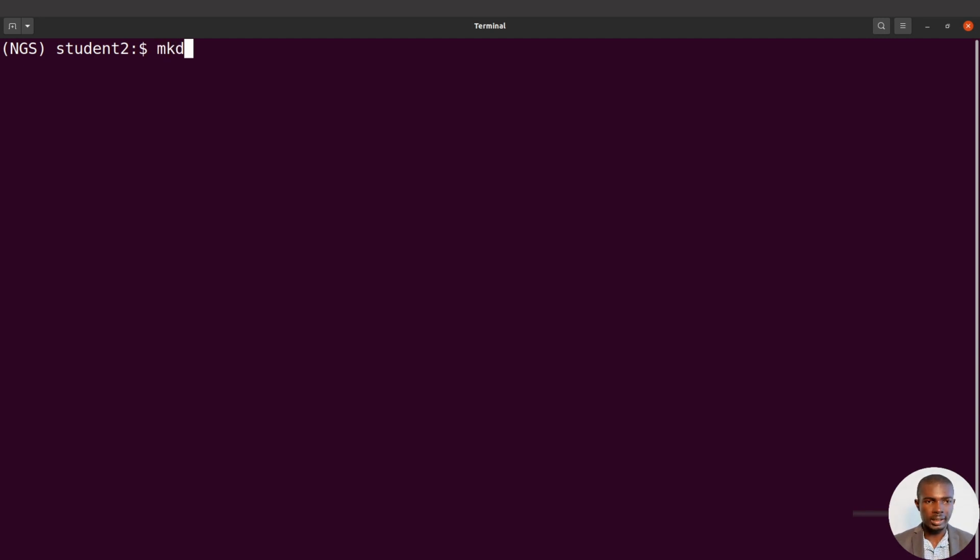So I'll say mkdir bara genomes. You can use any name of your choice, that's fine. And then I'll cd into it. And now I can proceed.